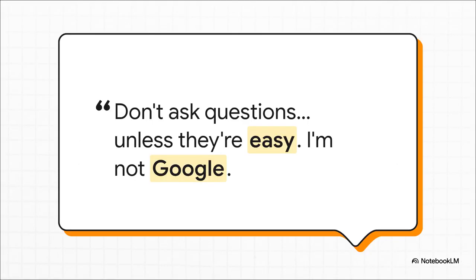We'll leave you with this fun quote from the author of our source material. Don't ask questions, unless they're easy. I'm not Google. And you know, qNMR might not be Google. It's not going to answer easy, everyday questions. But when you strip away the endless calibration curves, it answers the hardest analytical chemistry questions with absolute certainty. So think about it. What impossible analytical mysteries could you solve in your own lab if you had that kind of perfect head count right at your fingertips?